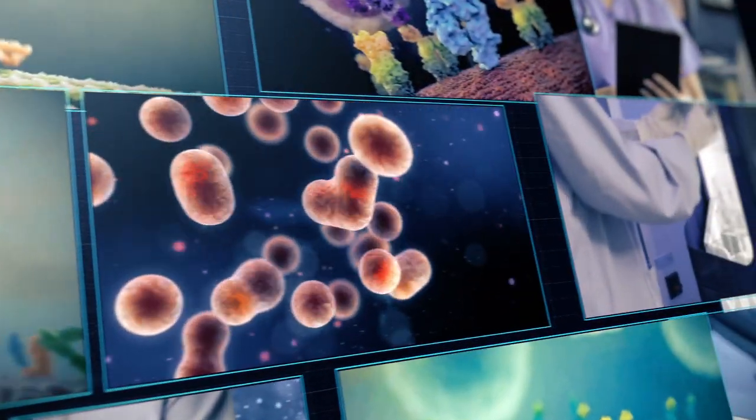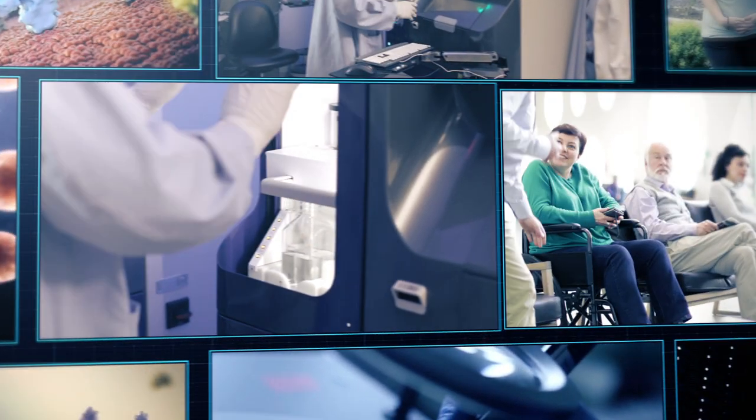Thanks to some inspired engineering from Berkeley Lights, companies like Amgen are better equipped to find the breakthroughs that patients need.